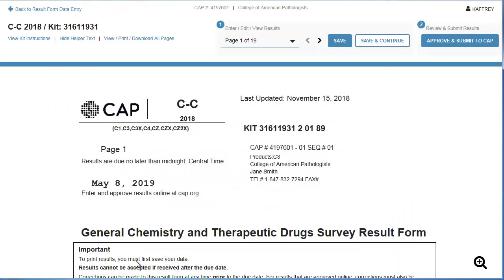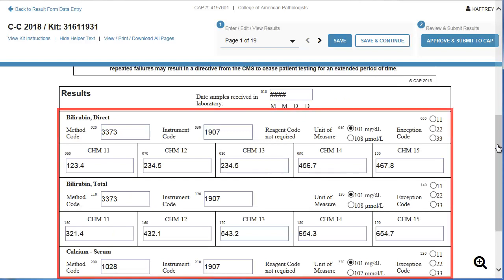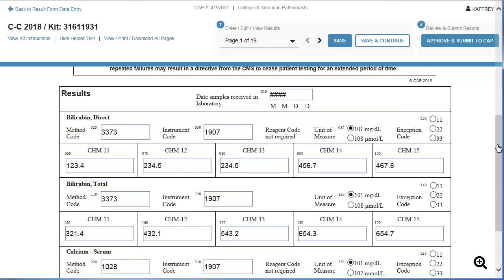A window with the first page for which you transmitted data is generated. The data appears as though it has been keyed in, but in reality, the data has been electronically transmitted directly from your laboratory.